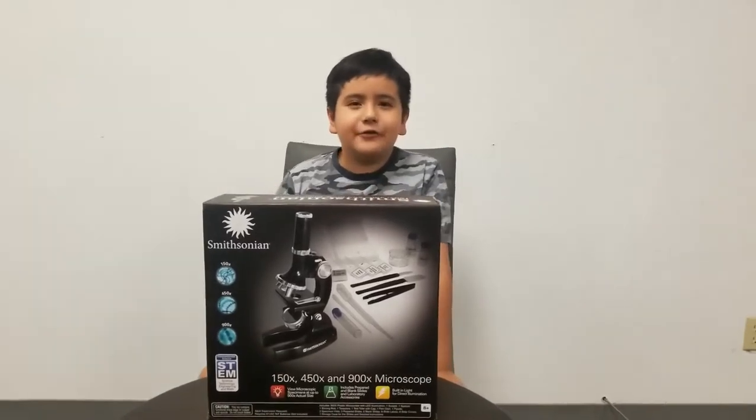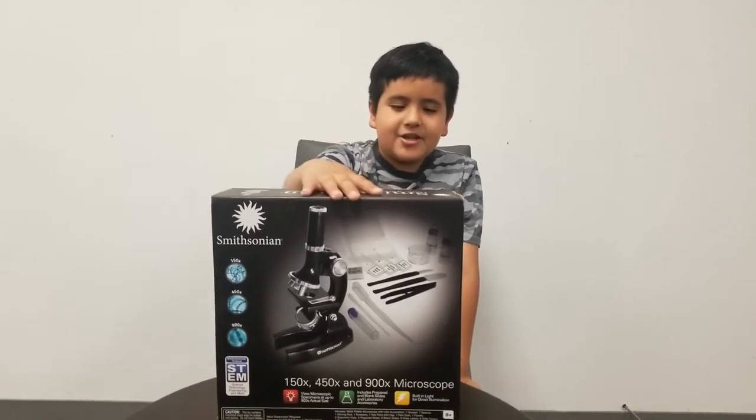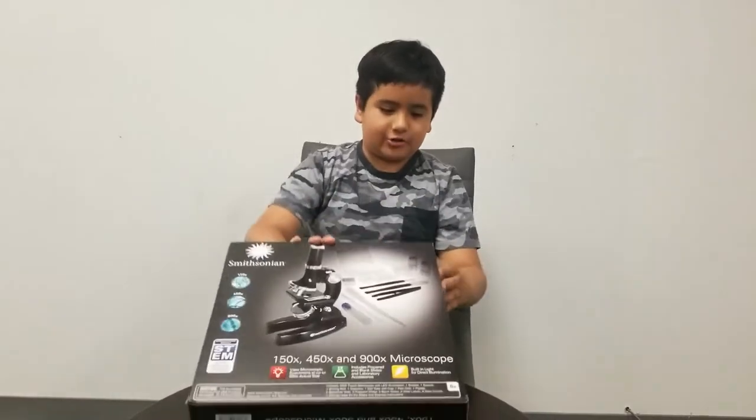Hey guys, welcome to another video of Miss A Lady's Point of View. Today we will be reviewing this Smithsonian microscope I got at Target for $19.99. Let's just start unboxing.